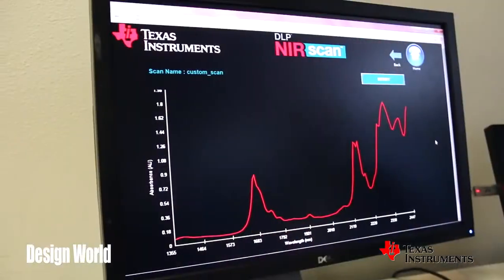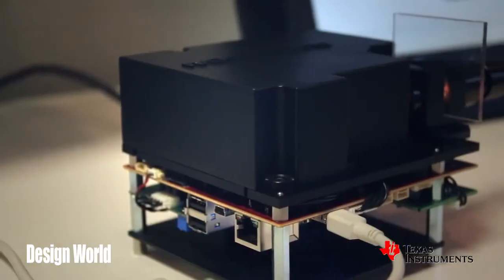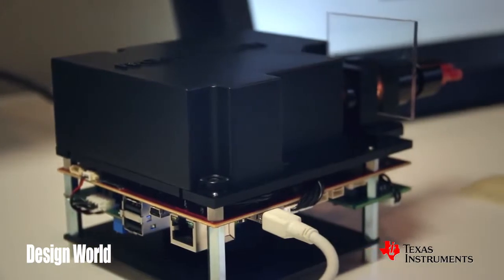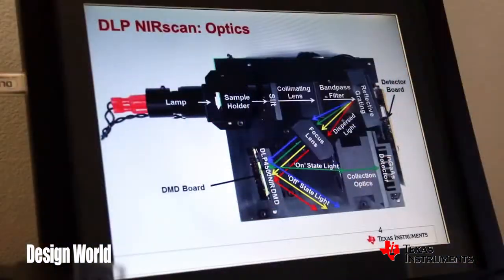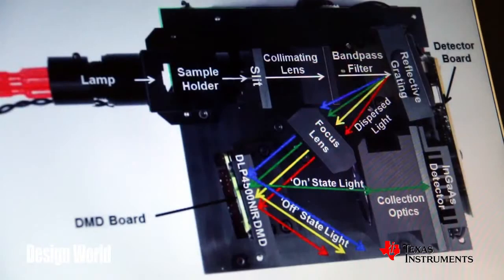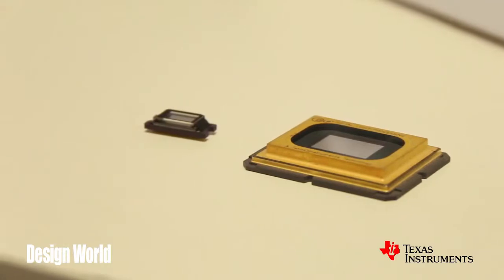The array of millions of micromirrors in the DLP chip is very powerful and very versatile for lots of uses. What we have here is an evaluation module that uses a DLP chip for a spectrometer reference design. If you look at this graphic behind me, I'll show you how it works. What you have is incoming white light — that white light gets dispersed by a grating and basically creates a dispersion or a rainbow across the face of the micromirror chip.